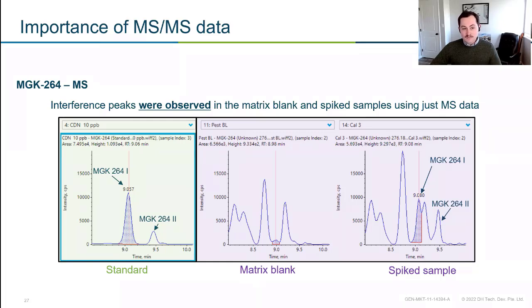And because of the sample, we knew it was a clean sample. So we went ahead and spiked it, and we saw our pesticides appear. But again, going back to our LC section, we didn't have the chromatographic resolution to separate them from that interference. So we end up with this kind of odd backwards L integration. I'm not super confident. I know that value isn't going to be very accurate, since I don't have my nice Gaussian curve. I don't really feel good about this data set when I'm just using my MS data.